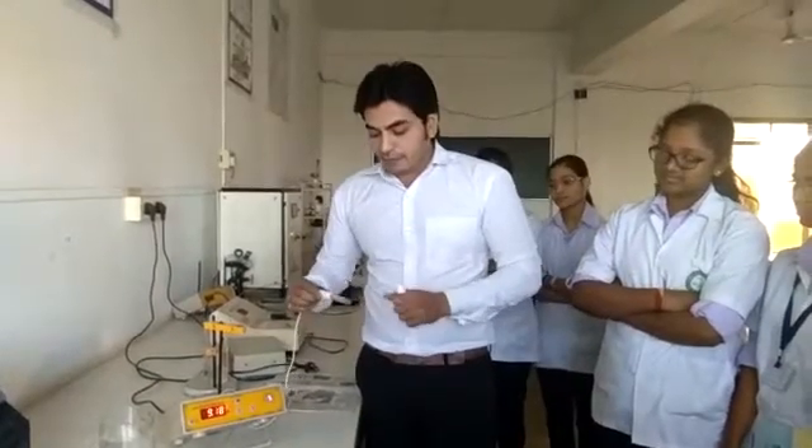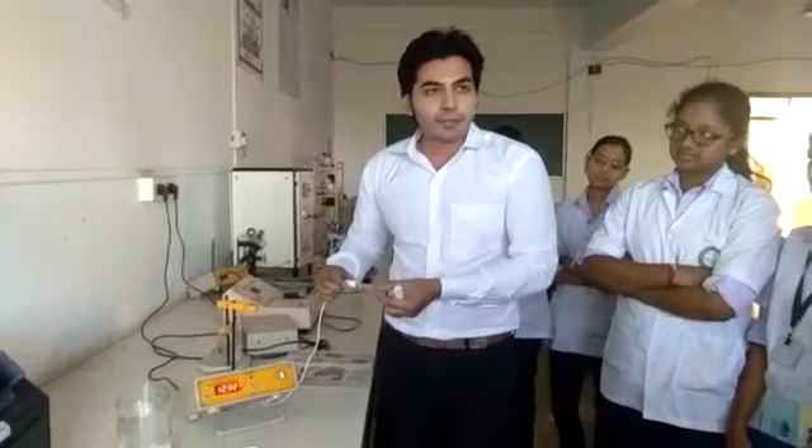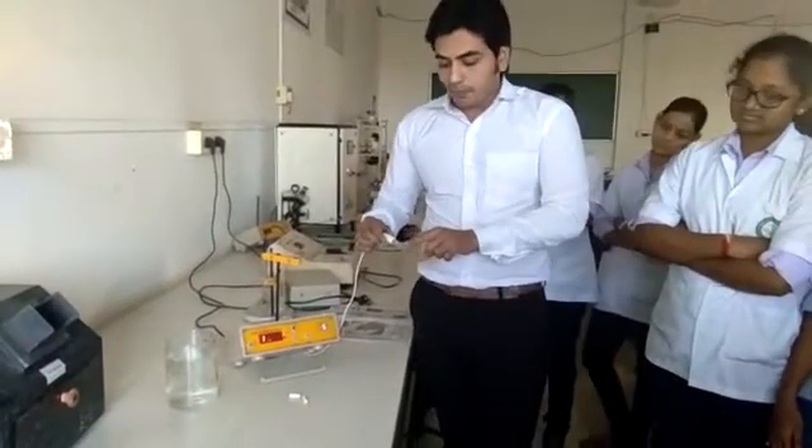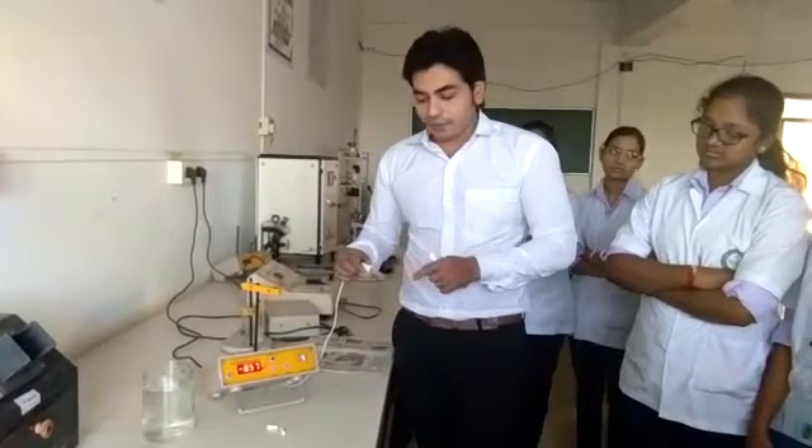It works on the principle of ion selectivity. This glass bulb is very selective for hydrogen ions. It contains 0.1 normal KCl solution and a fixed concentration of hydrogen ions inside.